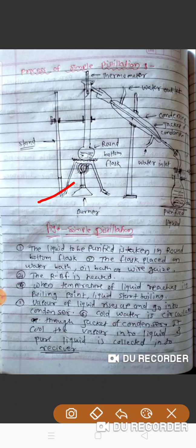When the temperature of the liquid reaches its boiling point, the liquid starts to boil. The vapor of the liquid rises up and enters the condenser, which is connected to the side arm of the round bottom flask.